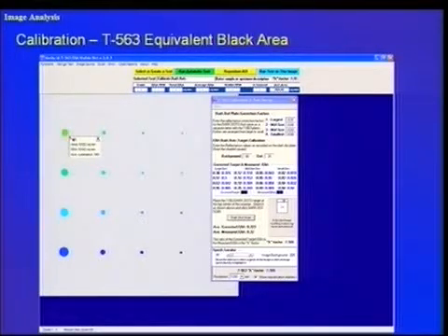The chart is scanned in initially during the calibration phase, and down below is the K factor called out in the specification that is calculated from the chart.